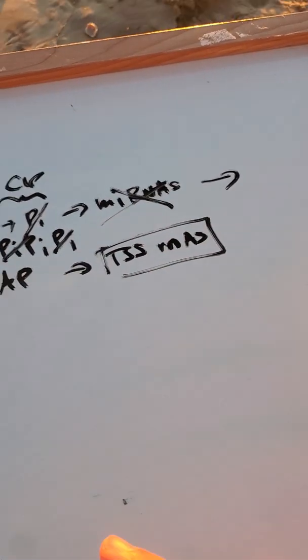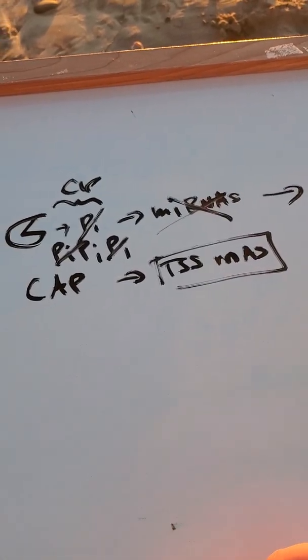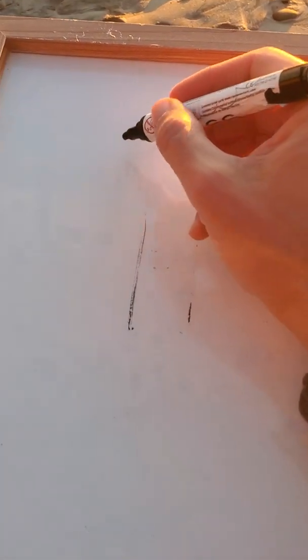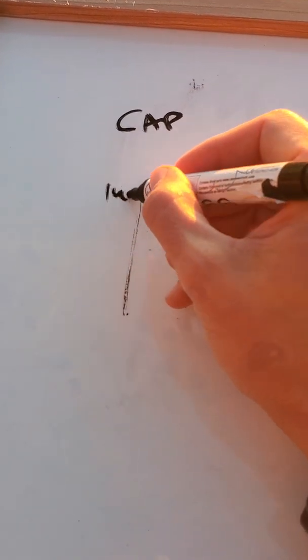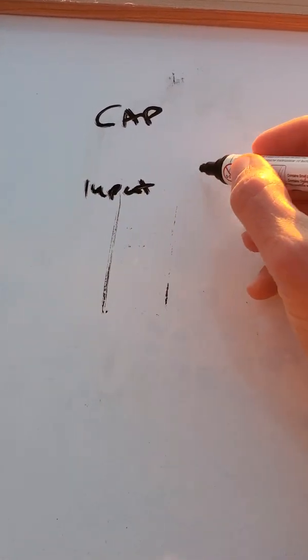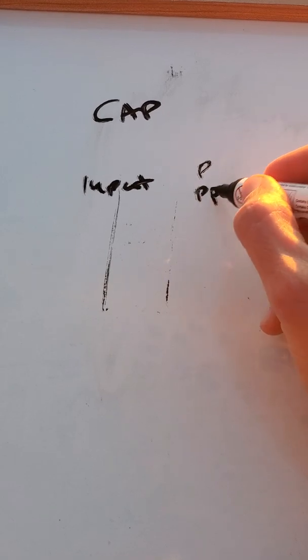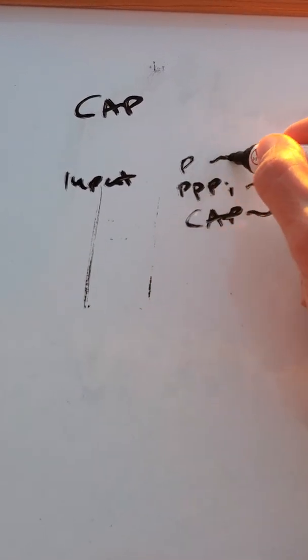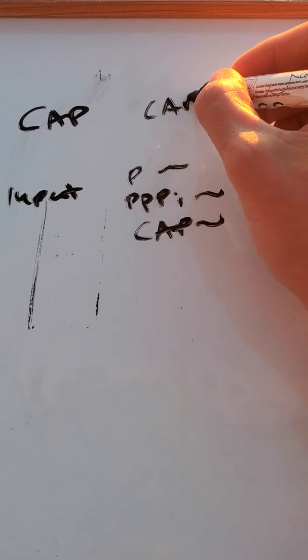And as we are hanging out here, these samples are precipitating. As we're hanging out here, our samples are precipitating, and tomorrow, at least after we spin down, we will have our capped enrichment and we have our input. So this has basically all the different phosphorylations and cap, and this has our cap.